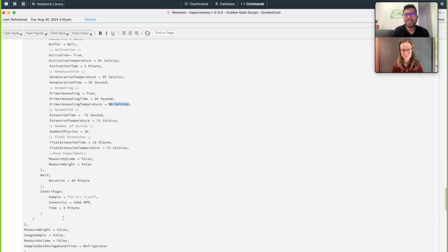If not, then you might just end up with samples stuck on the side of the well, and then later on, subsequently, there might be unsuccessful transfers happening.